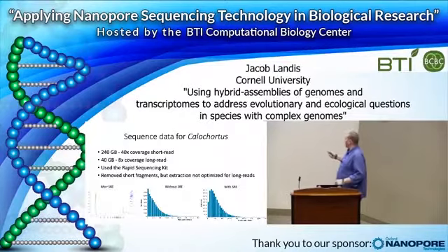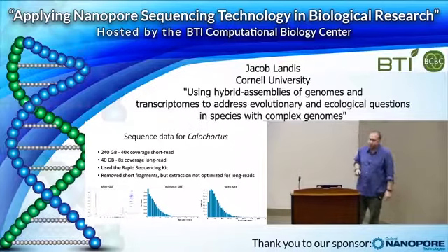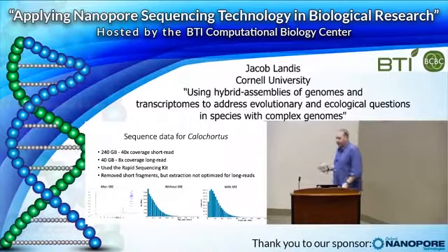And one thing I would mention, I did truncate these plots, but we were getting some reads that were over 500 kb. Not a whole lot, but we're getting some very long fragments.